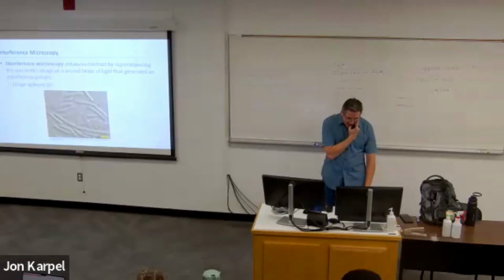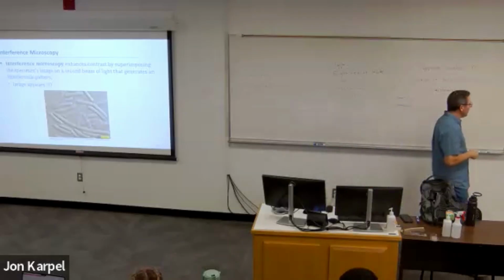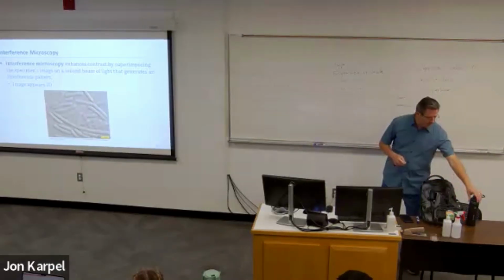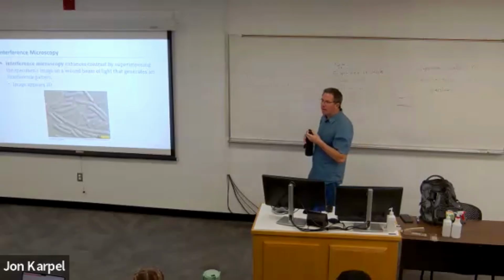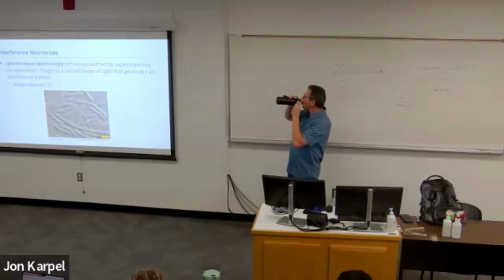And another example, interference microscopy. So this one again gives you kind of a 3D view of whatever structure you're looking at. Cool. Some of you might go into microscopy or a medical lab. You can play around with all sorts of microscopes. Kind of cool.